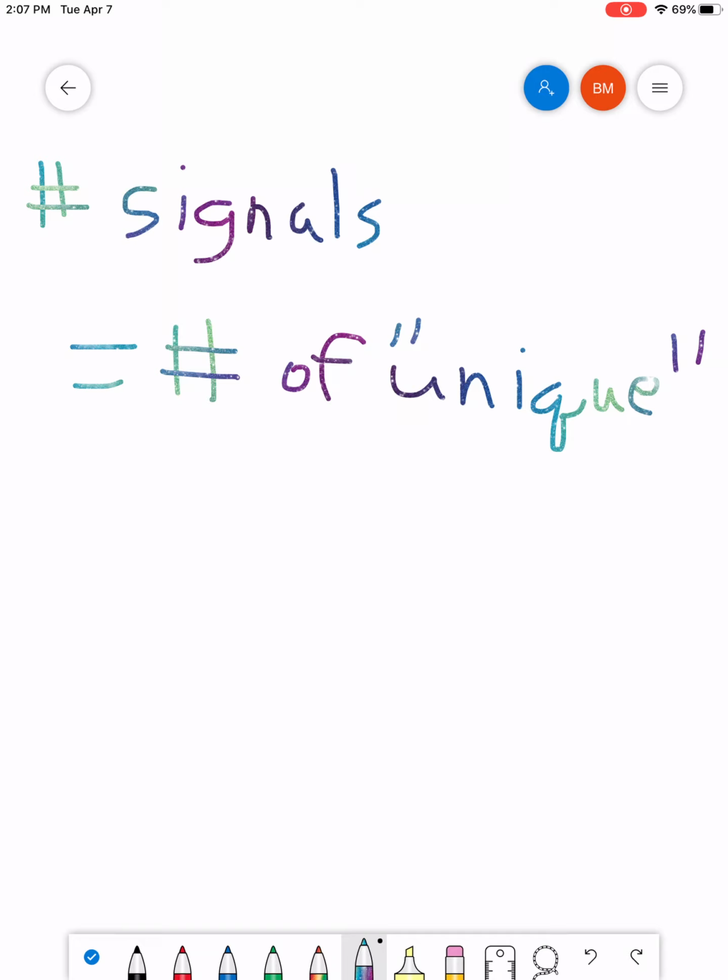And we've seen this before, right? We've seen in certain molecules, due to symmetry, for example, you can have H's that basically are the same type of protons that you would find on the other side. Alright, so let's take a look.